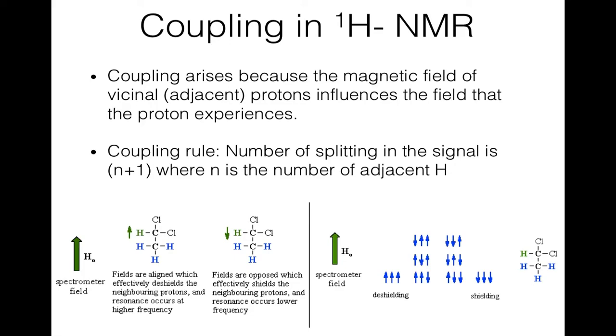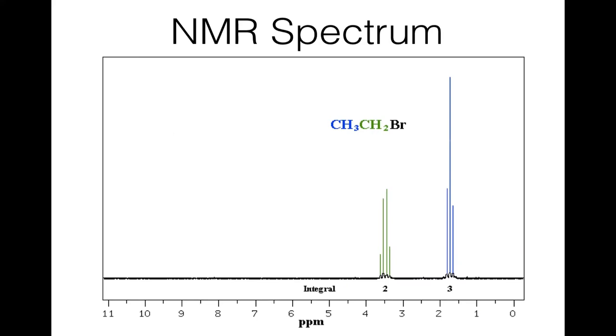From the NMR spectrum, the information of the neighboring hydrogens can also be identified. NMR provides information on how many hydrogen neighbors exist for a particular hydrogen or group of equivalent hydrogens. In general, an NMR resonance will be split into n+1 peaks, where n is equal to the number of hydrogens on the adjacent atom. Let's look at the ethyl bromide example again.